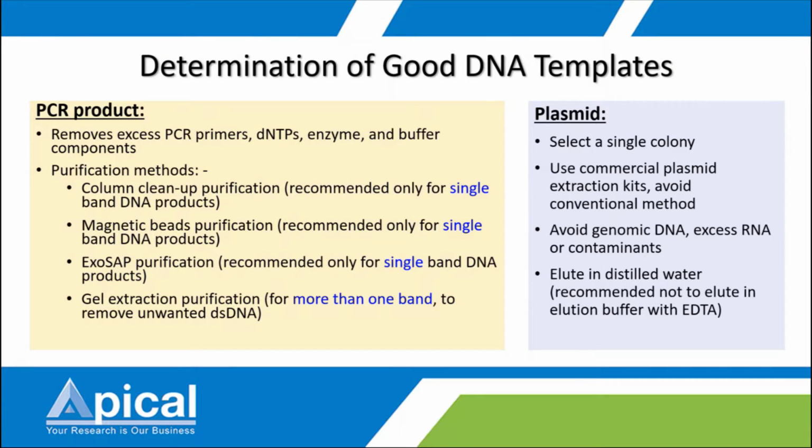The DNA purity can sometimes be a question. According to our experience, some customers using the ExoSAP method found it affected the sequencing result. You still get a result, but it gives a shorter read length.